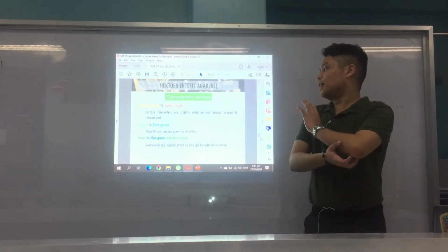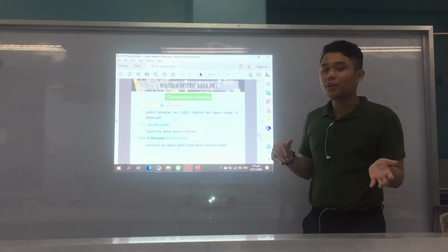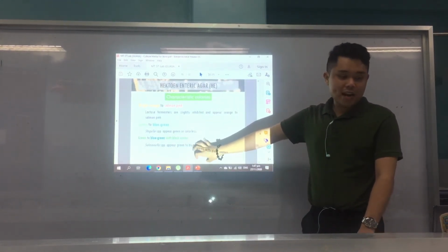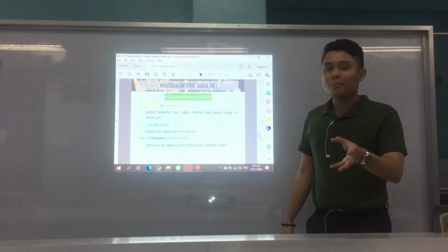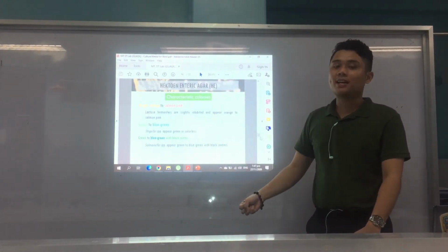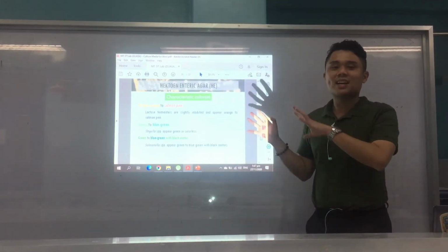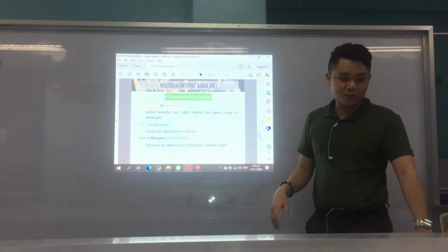So as you can see again, bright orange to salmon pink are lactose fermenters, so other members of the enterics, especially katong mga lactose fermenters. So what we're looking for is the green to blue-green and kaning green to blue-green na naay black center. Green to blue-green na walay black, because dili mo-produce H2S, that could be Shigella. And green to blue-green na naay black center, that could be Salmonella. So kung Salmonella, usually naay black na something sa iyahang colonies, because again, it produces H2S.